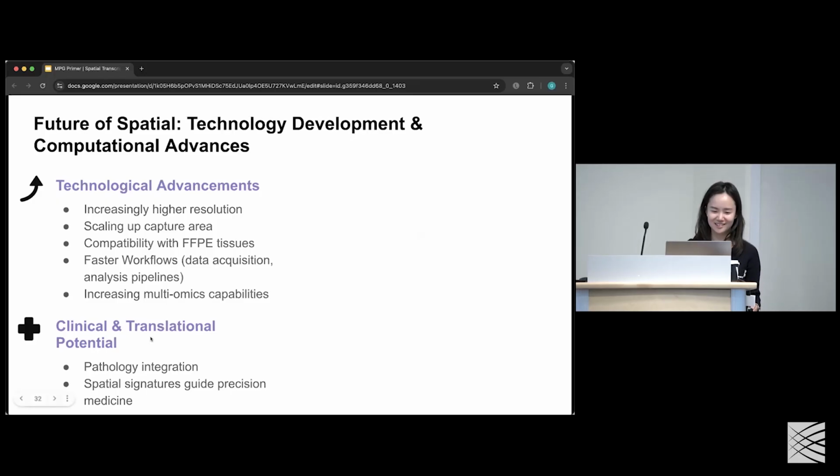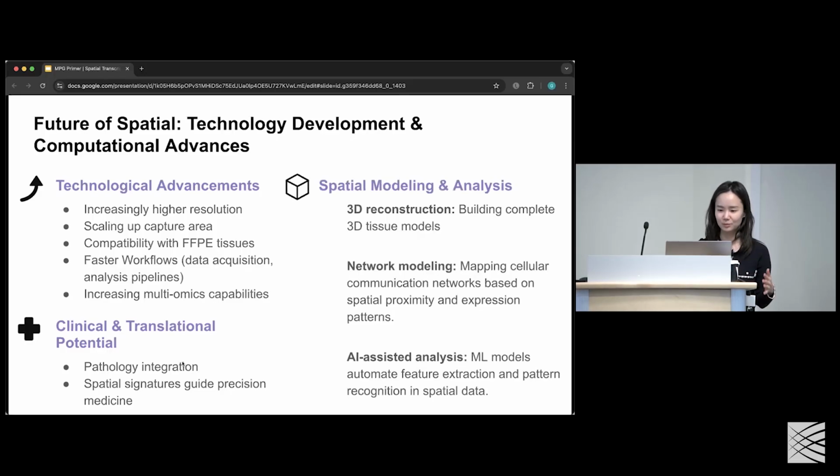One thing that I'm personally interested in is pathology integration. A lot of neurodegenerative diseases, or all neurodegenerative diseases, have these protein pathologies that, one, are protein, and two, may not be inside the nucleus, especially when you're using a dissociation-based technology. So really integrating that and being able to capture multidimensional information would be useful.